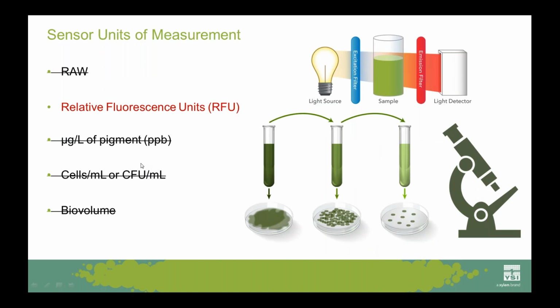So we're running out of time, so I'm going to sum up this last point by saying, please use relative fluorescence units. People doing monitoring should be looking for changes from a baseline fluorescence in the water, not comparability to laboratory analyses. So using the monitoring data will help you decide if or when you should collect samples for your lab. The relative fluorescent unit is the truest measurement delivered by the sensor.